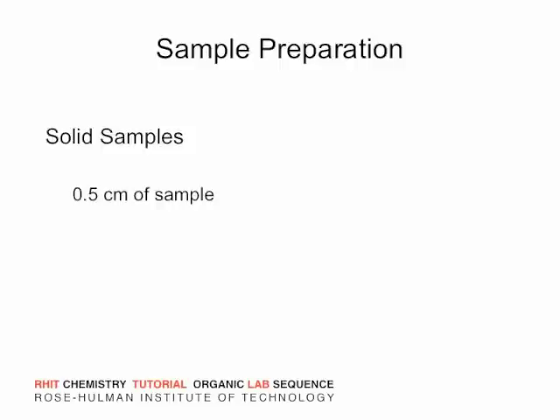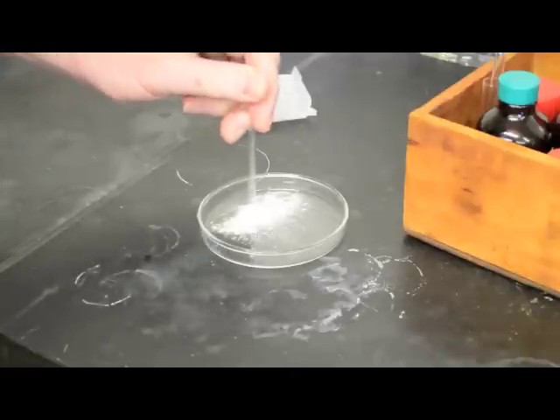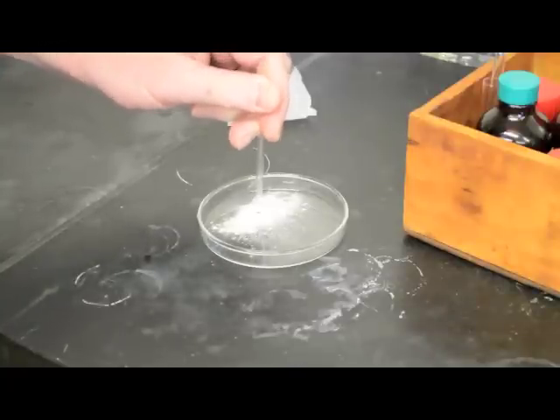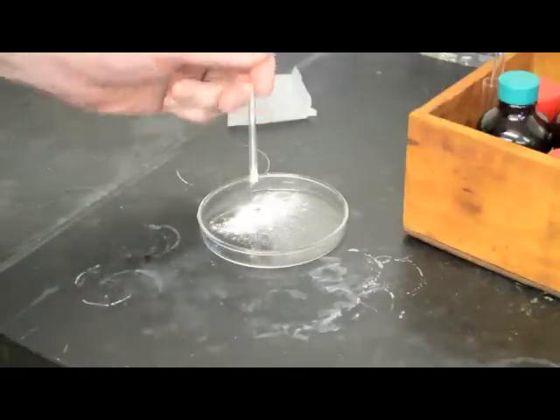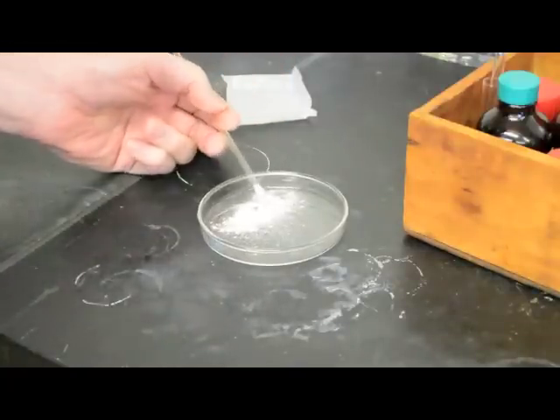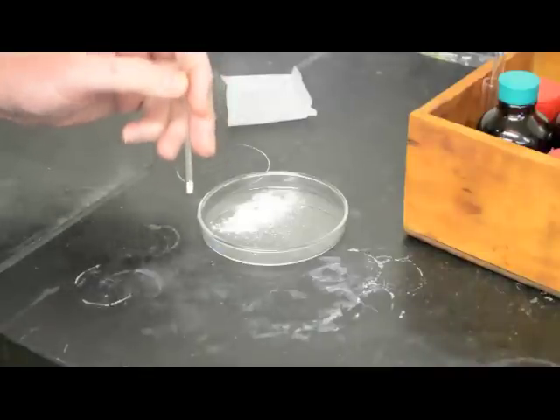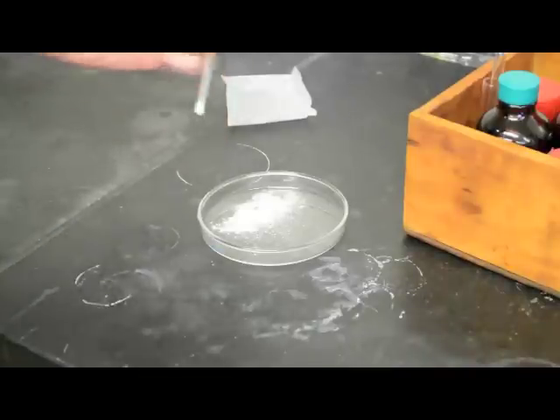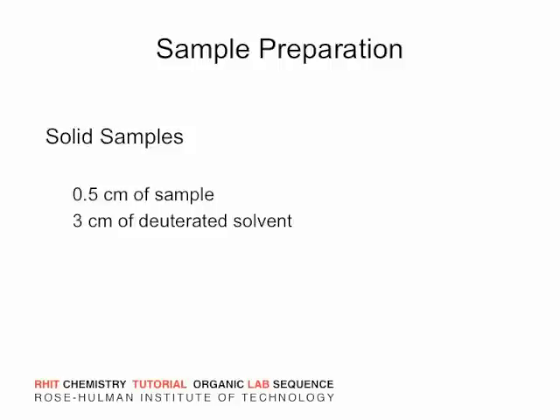Place about half a centimeter of sample into the NMR tube. For solid samples, the simplest method to do this is to press the open end of the tube against some of the sample and then gently tap the tube to encourage the sample to drop to the bottom of the tube.